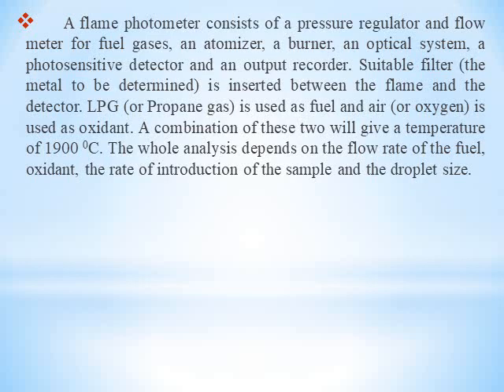This photosensitive detector records the emitted intensity when the electrons in metallic atoms come back to the ground state by emitting a certain frequency of radiation.